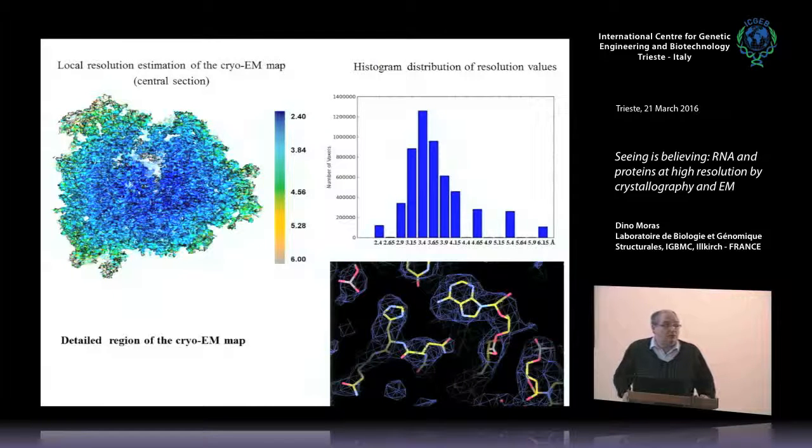I must say at this point, it is important when you have large complexes, I will come back to that also later, it is important to have starting information. If you had to build from scratch, that is knowing nothing, it would have taken a long time. When I show you the data collected in 2014, the paper published in 15. That's the speed.